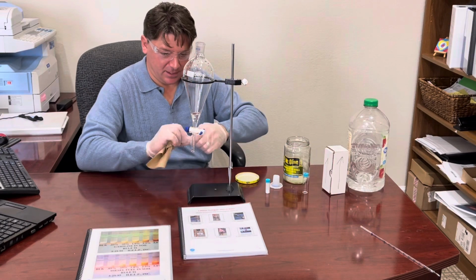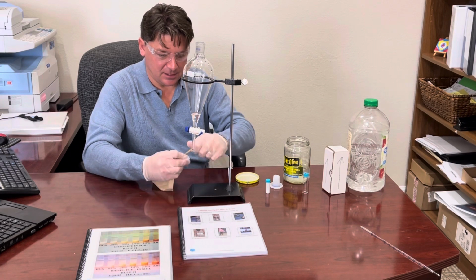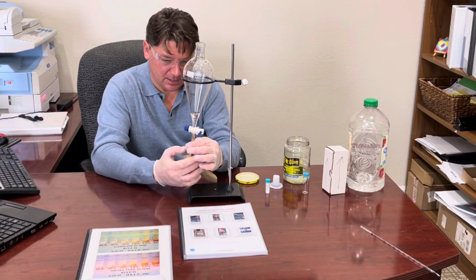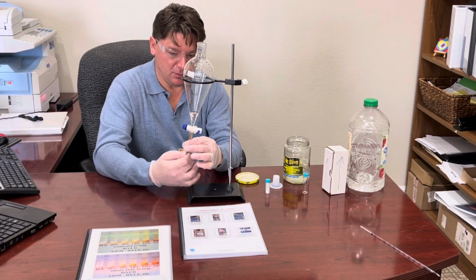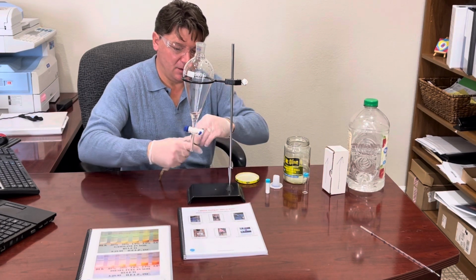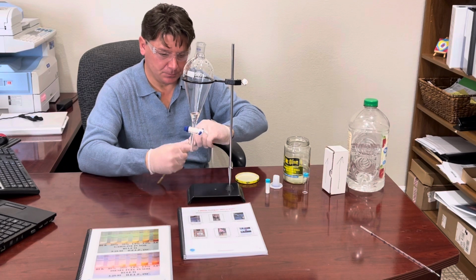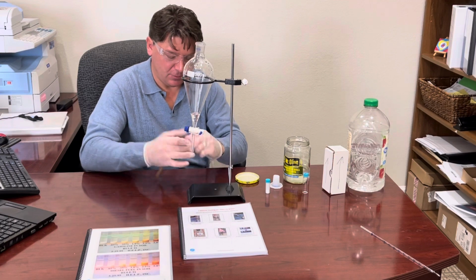And again, we're still going to take the extra precautionary step of taking some rolled up paper towel and sticking it up in this stem, drying it out just to make sure, double sure that there is no water here, because that solvent will push through that water into our test tube, and we don't want that because it'll react with our catalyst powder. So we want to make sure this is dry. Do it again. Just to make sure that it's completely dry up in there.